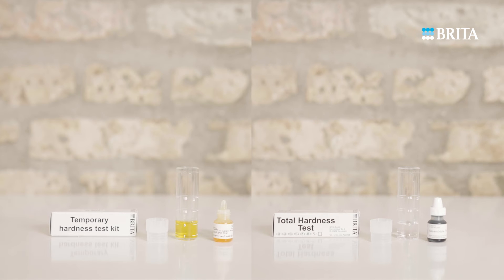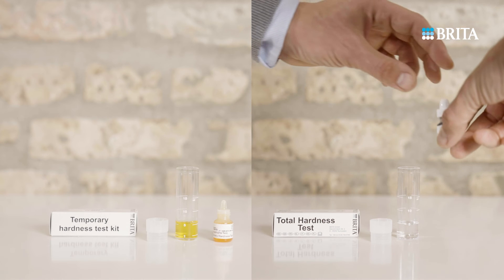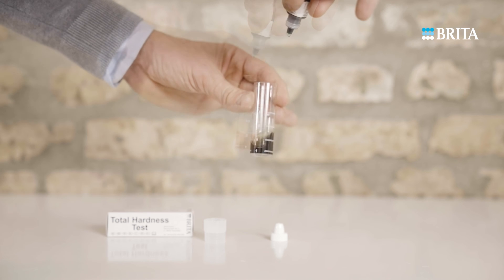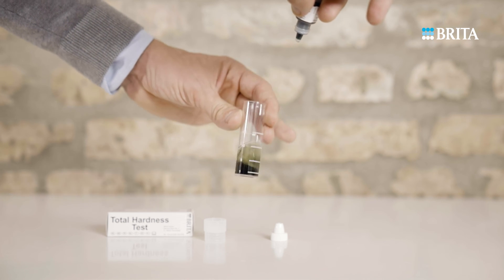To determine total hardness, use the total hardness test kit in the same way as described for the temporary hardness test kit. Add indicator solution drop by drop until the color changes from red to green. Each drop represents one degree of total hardness.